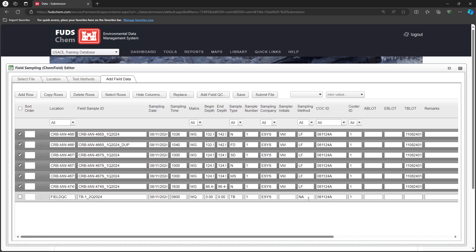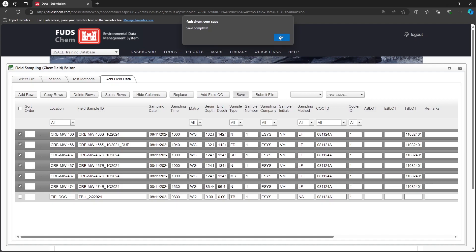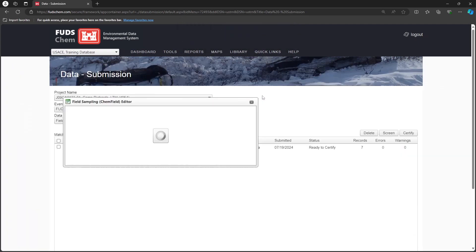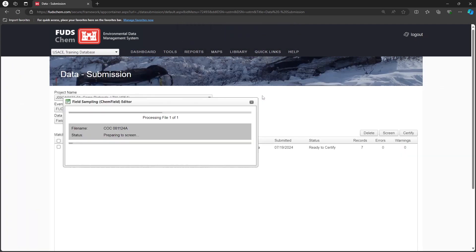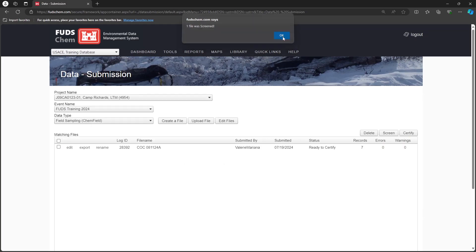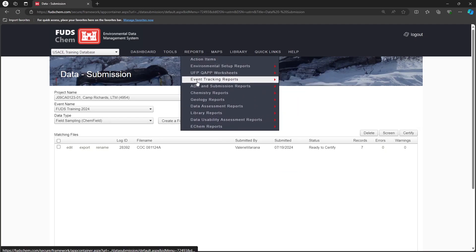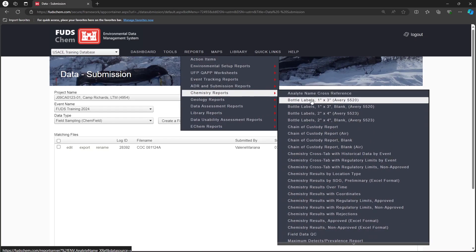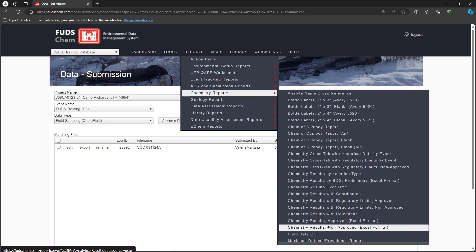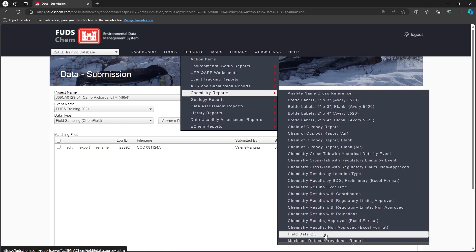Now that we have entered all of the information from our field team, click Save, then Submit File to screen it for errors. For assistance troubleshooting errors, please reach out to your Synactics point of contact. If you want to QC your file before certifying it, you can go to Reports, Chemistry Reports, Field Data QC to review the entries.